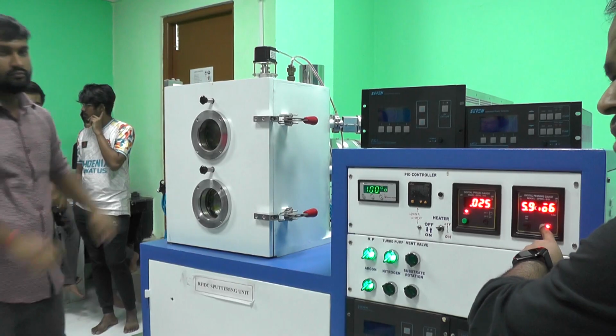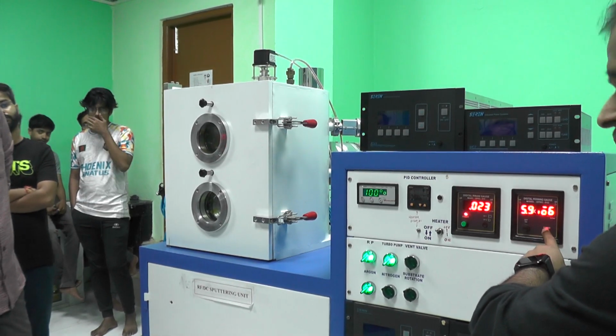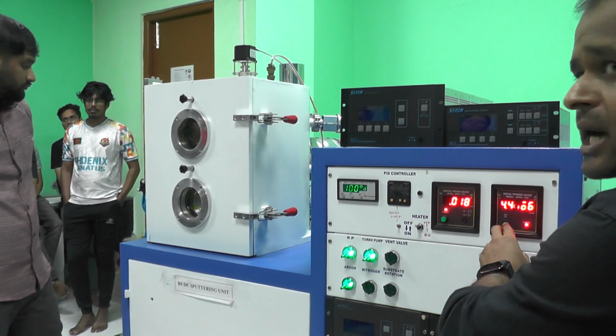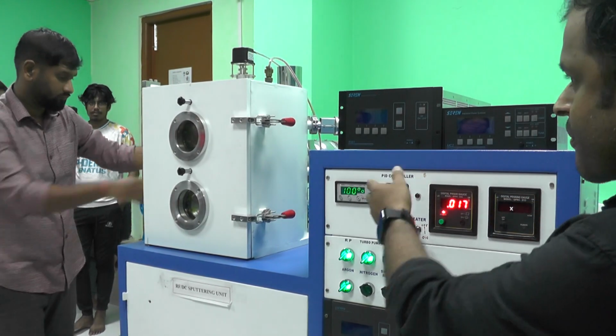Now it's almost 10 to the minus 6 millibar. Now we introduce our argon.